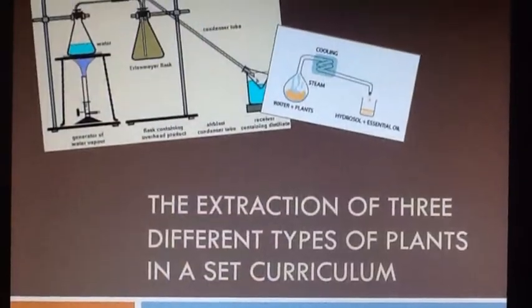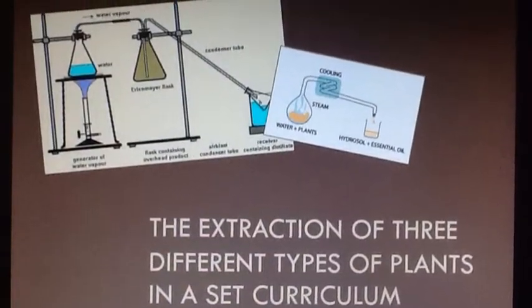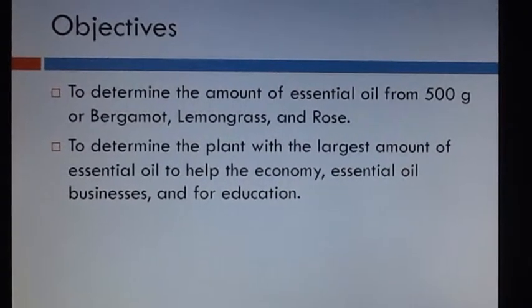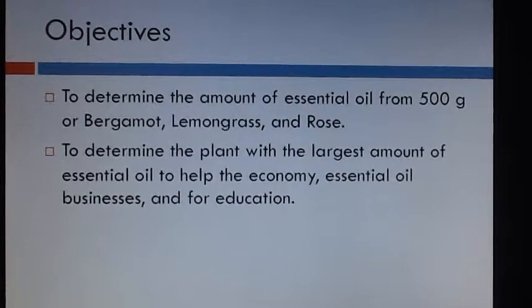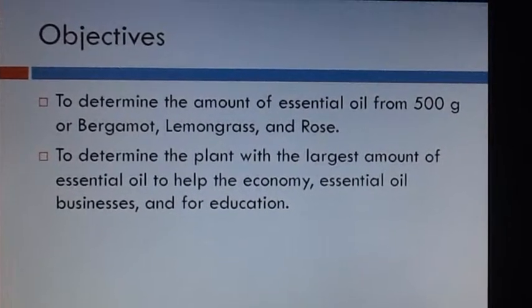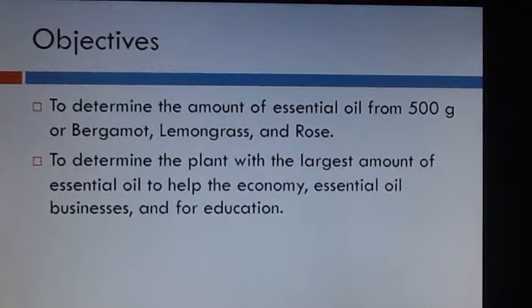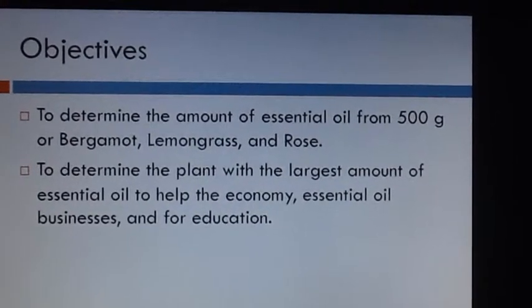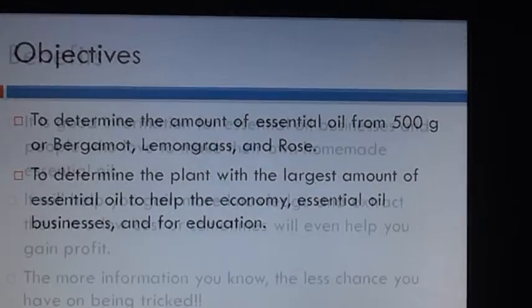Today, I'm going to tell you about my science project, which is about the extraction of essential oil from steam distillation. The objectives are to determine the amount of essential oil from 500 grams of 3 different types of plants. The 3 different plants are bergamot, lemongrass, and rose. And secondly, to determine which has the largest amount of essential oil.